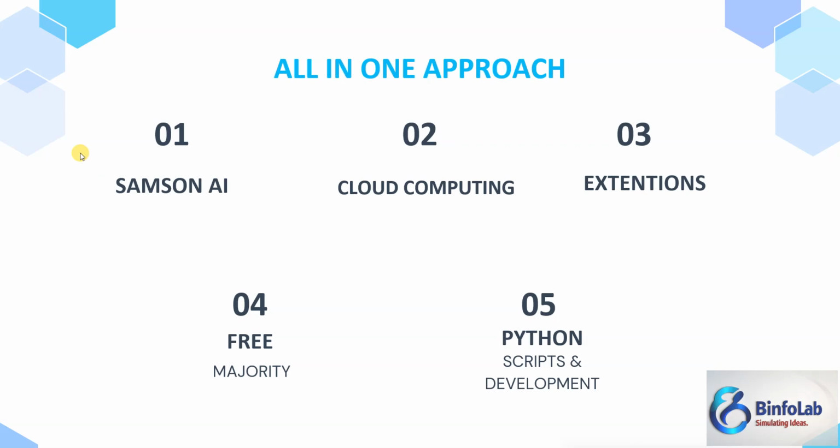Besides, AI is also working as an agent. Agent means assistant, just like someone is sitting on the other side of the SAMSON screen, and if you ask it to make the color blue, after 2 or 3 seconds, bang, you will see a blue color. So I use the word assistant or agent, whatever.